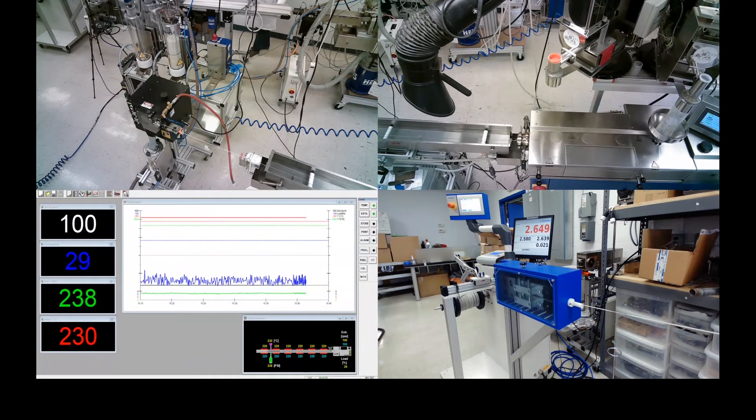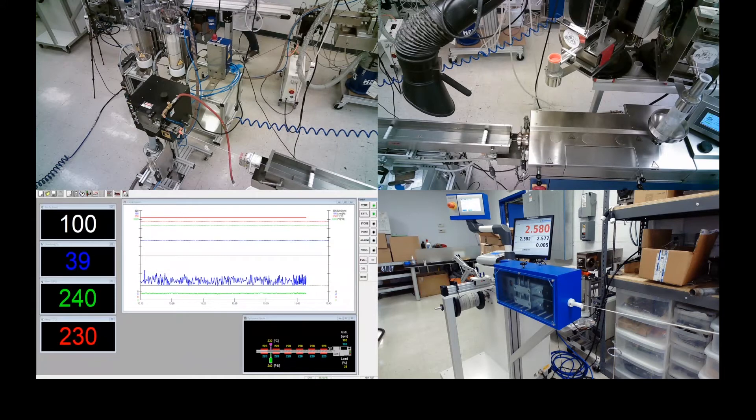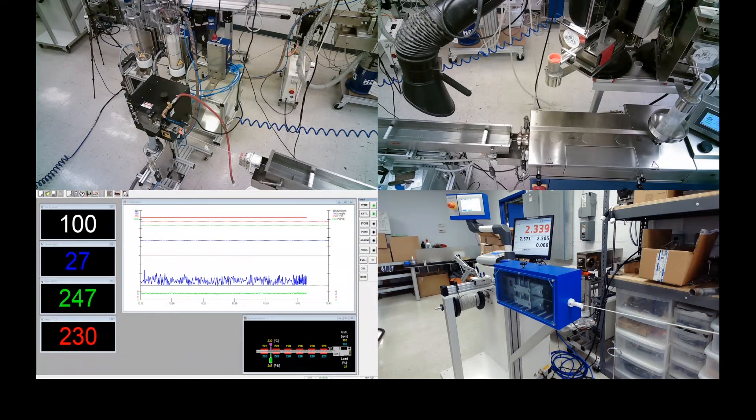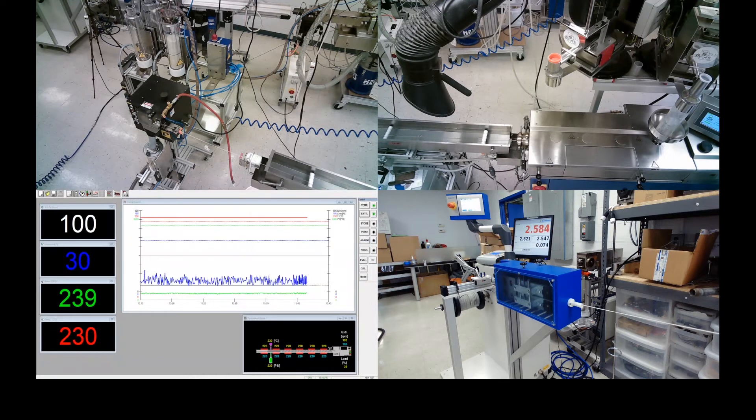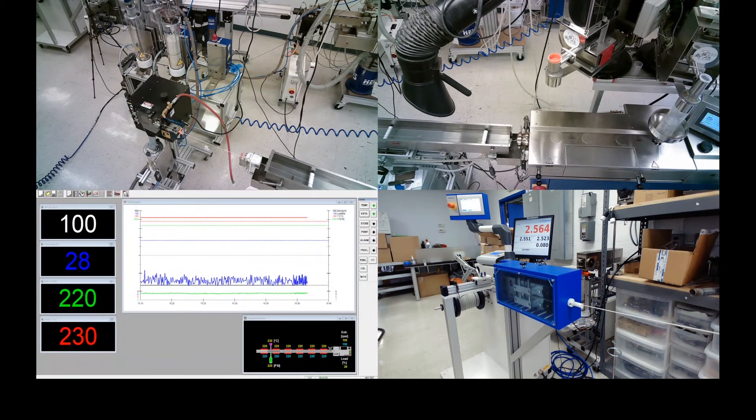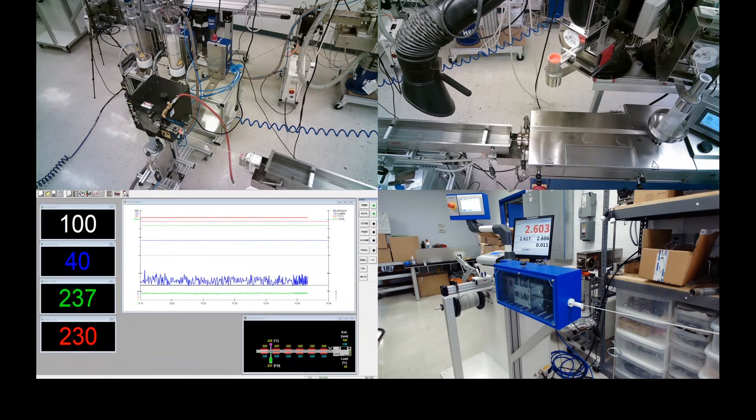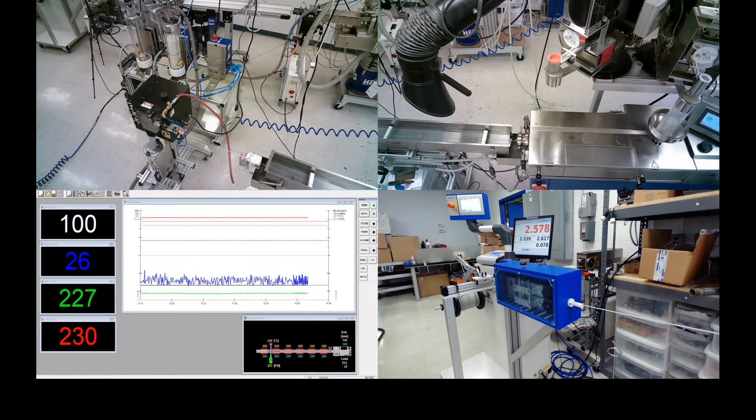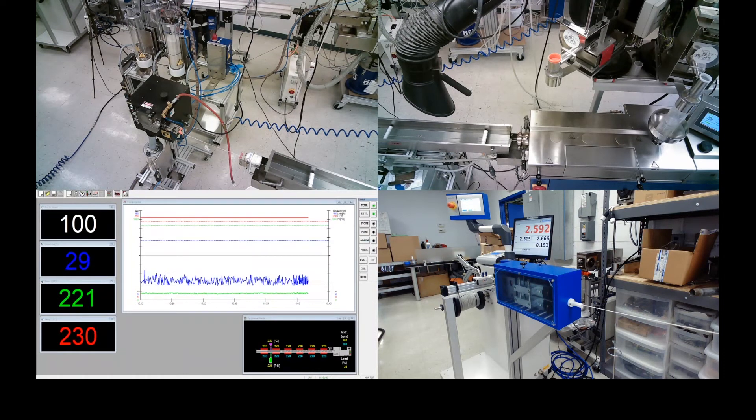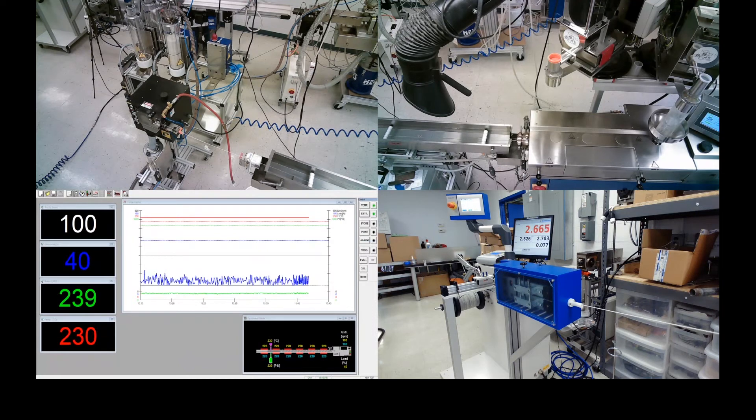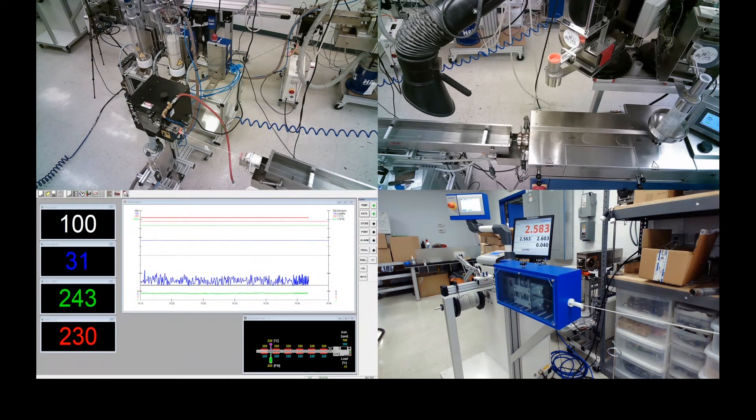This is one of the powerful features for our virtual laboratory experience. You can see here in the video, the performance, everything that we showcase, you will have the entire video feed based on what we currently want to highlight. You can see in a close up shot or when you just want to monitor how it's going, you can take the four window, four camera overview setup.